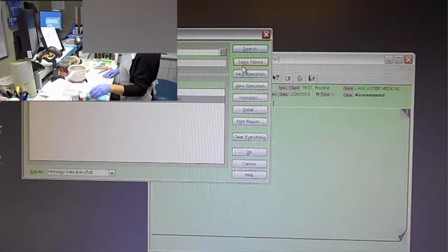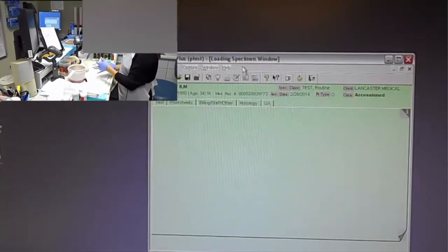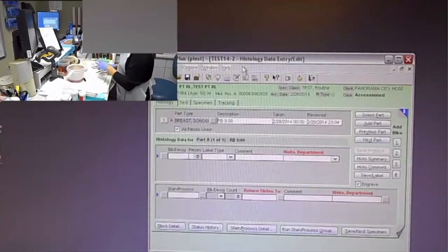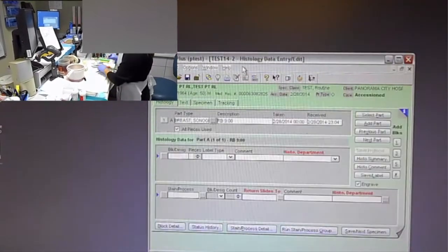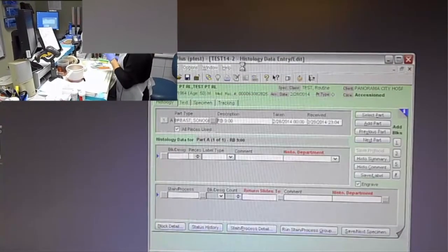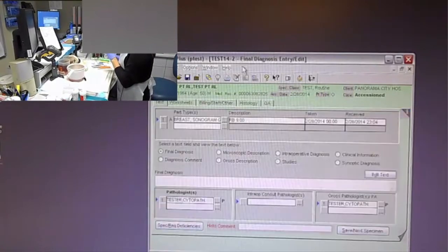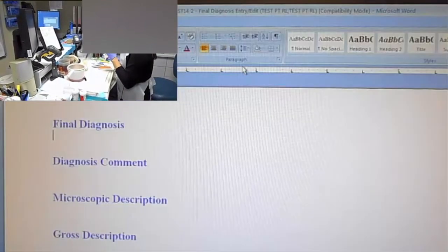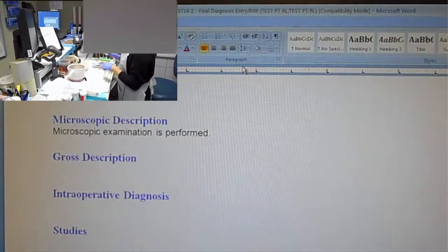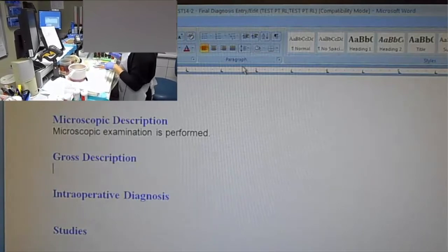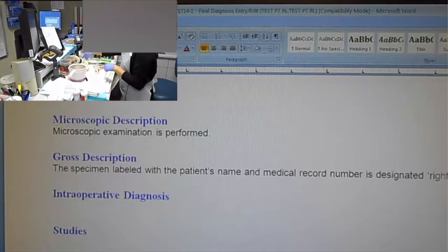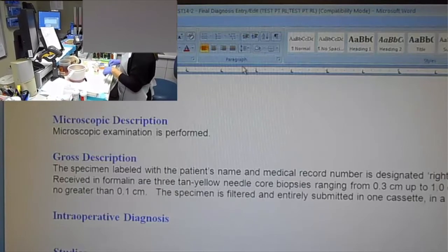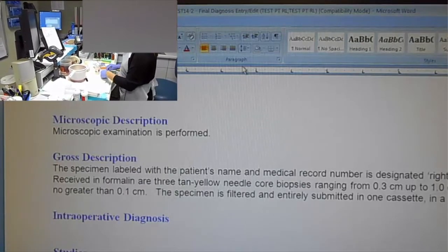Again, she's going to scan into the left scanner to go into the case for the next breast core instant statistics. Move into histology entry edit, print out cassettes, move into final entry edit, move into Word, microscopic examination performed, and then she says her canned dictation.